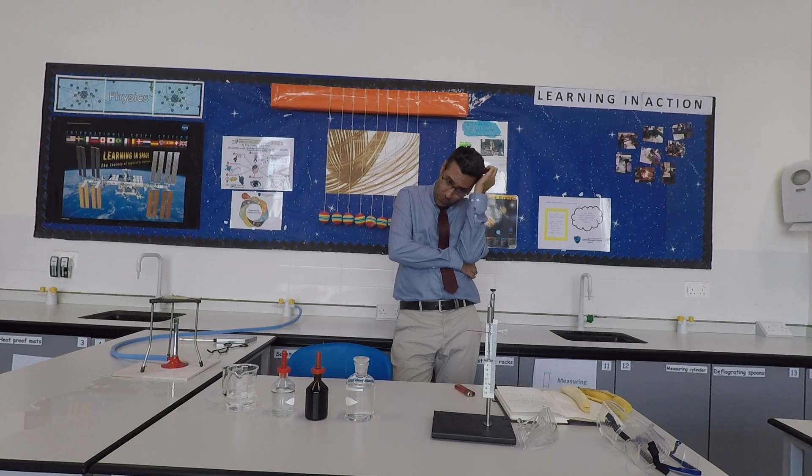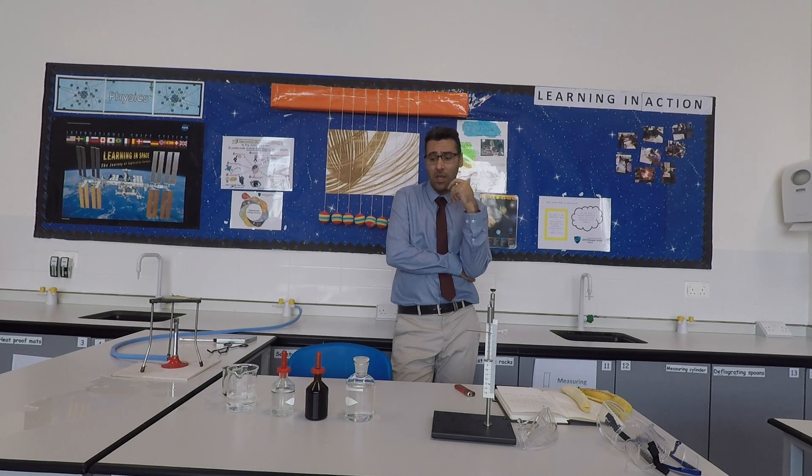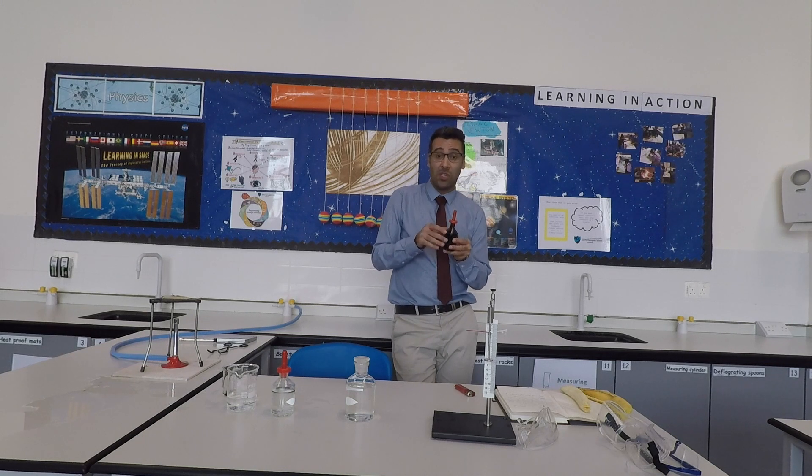Here we continue with eating, drinking, and smelling chemicals that you don't know what they are. Not all chemicals are safe to smell. Some of them can be poisonous — they can harm your lungs. So don't smell them, especially if they don't have any label and you don't know what it is.